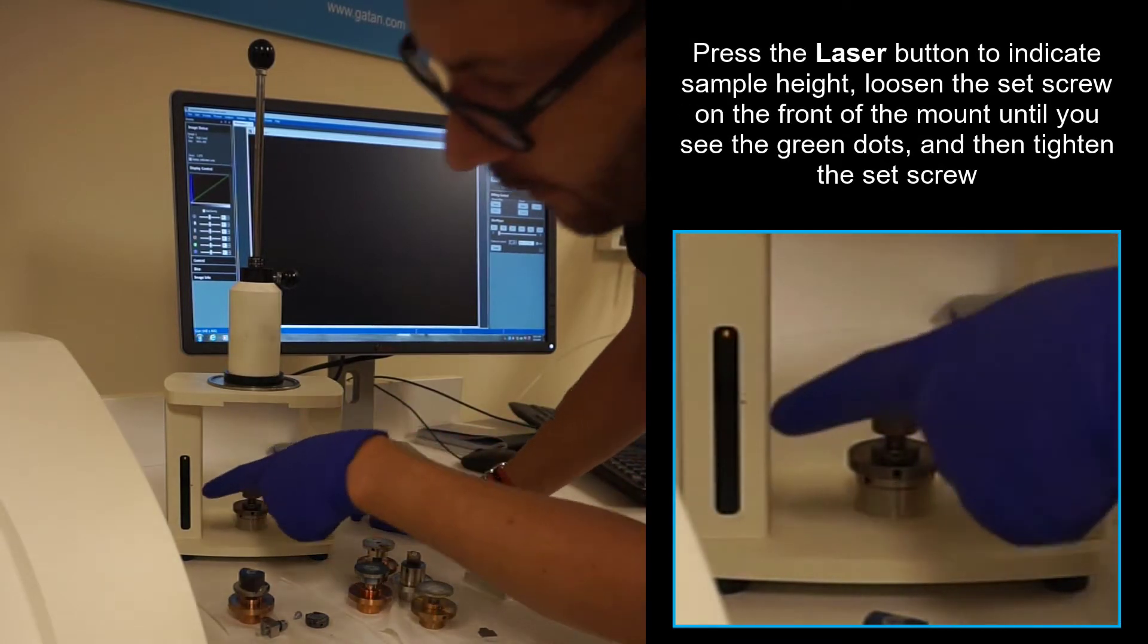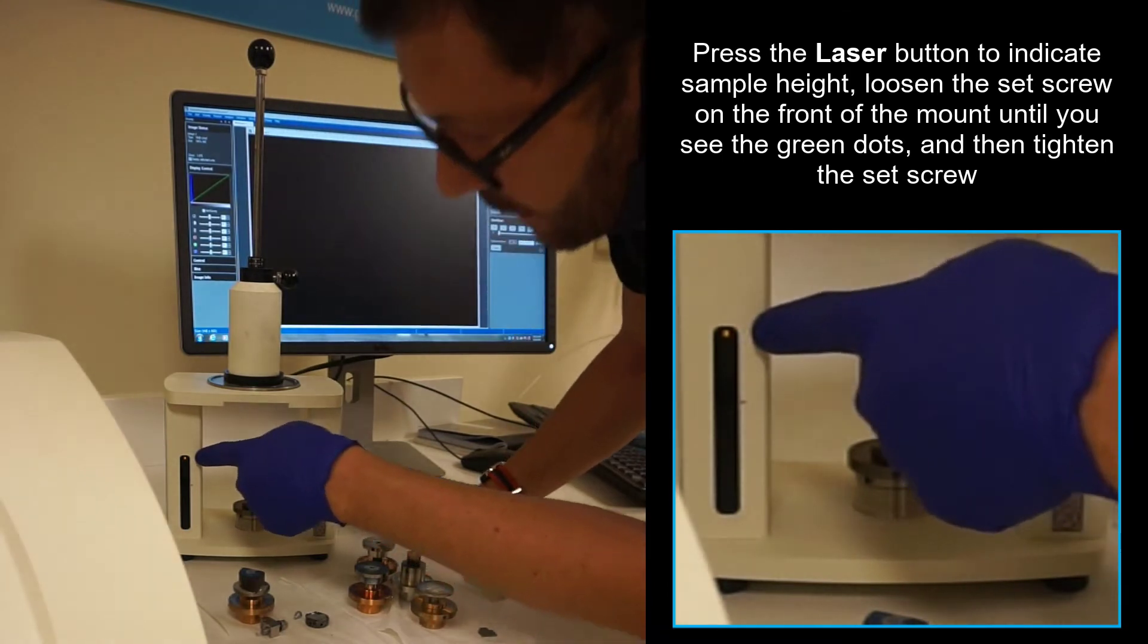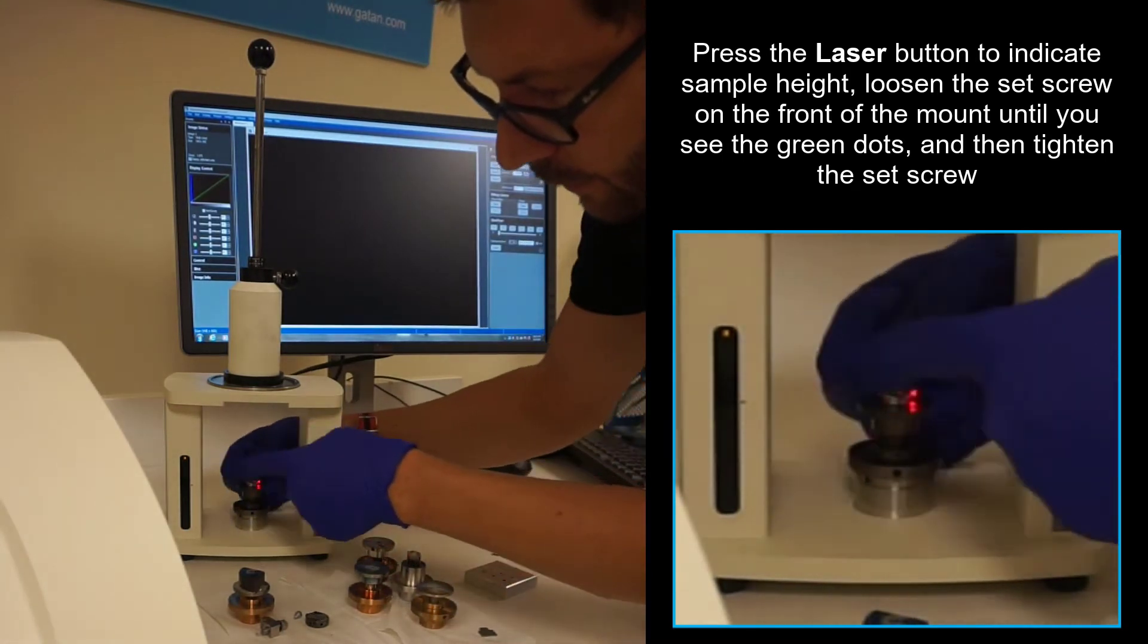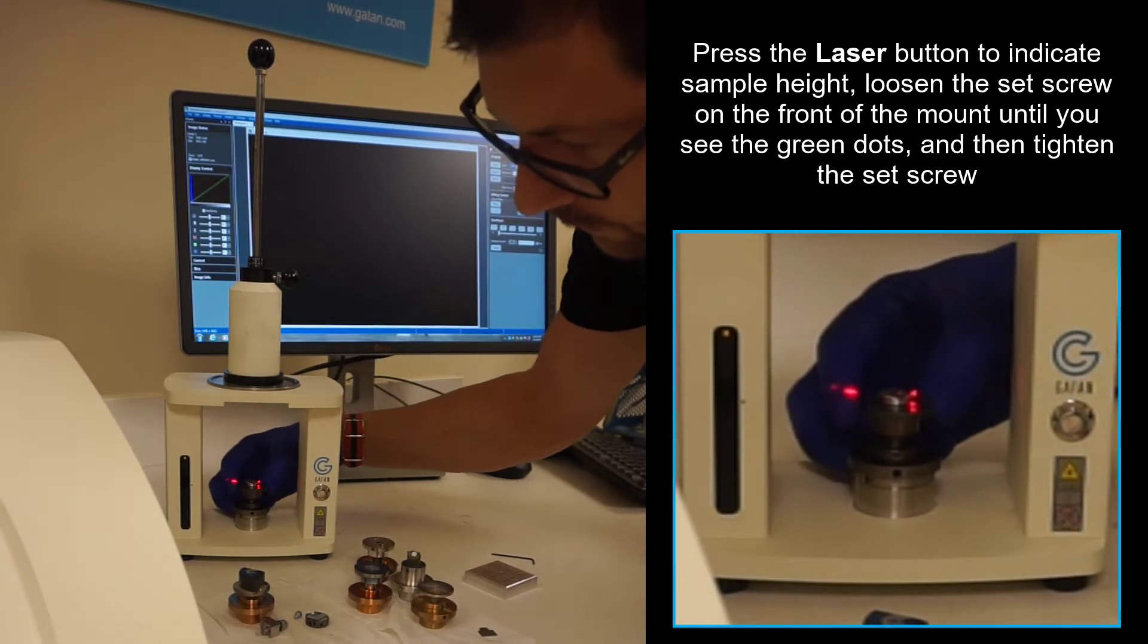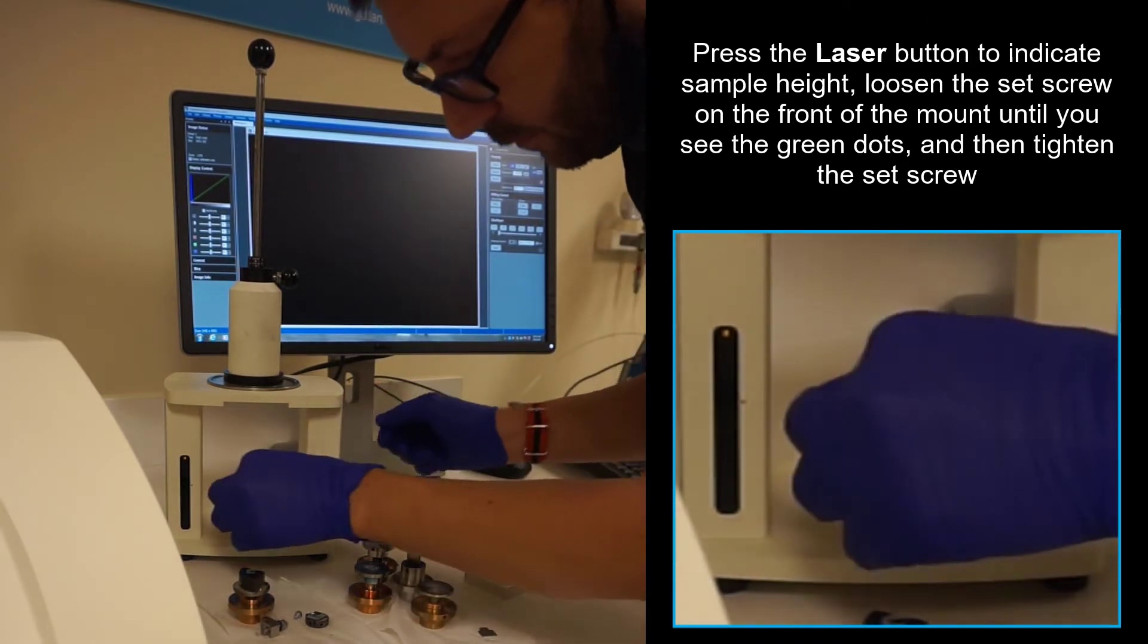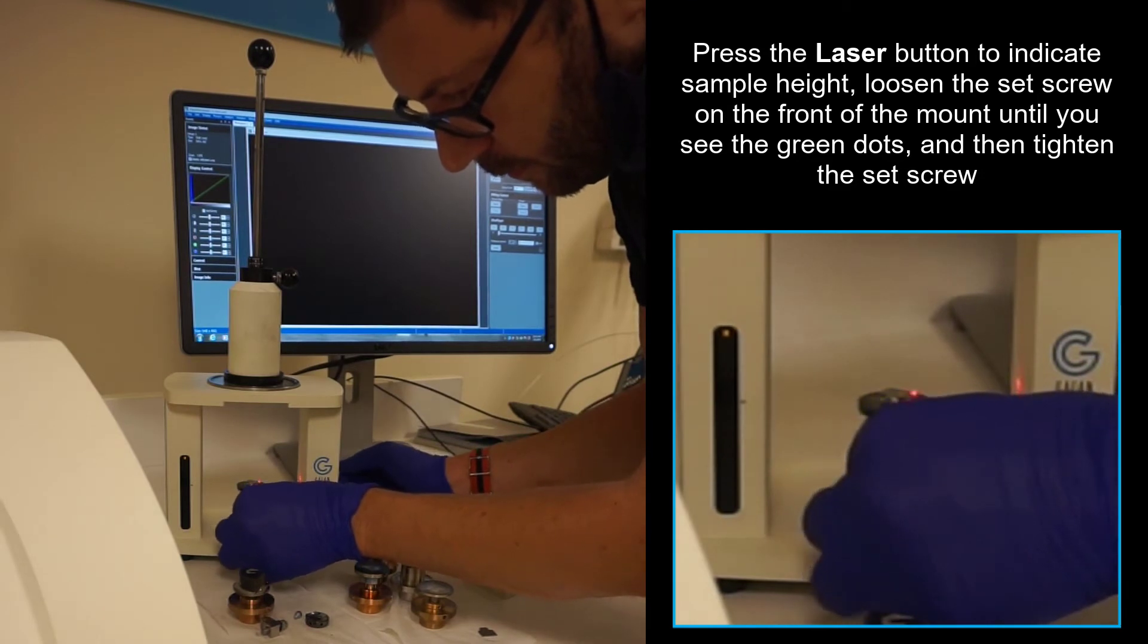Push the button to see where the sample is. The sample is too high. There's a little LED light here with the sensor. We need to lower it, which is held by a set screw.